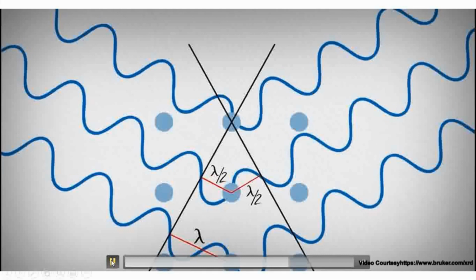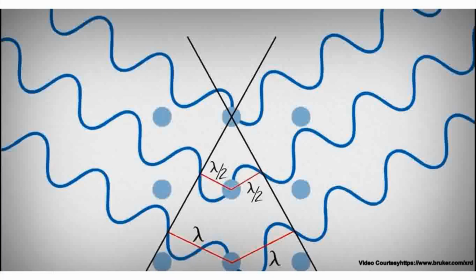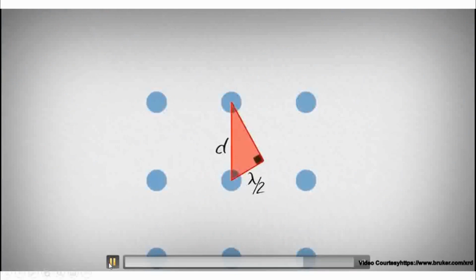So this is something which you understand here, and this keeps happening for all the planes as we go. So if you see here for this plane, you see the lambda. So this is one complete lambda which it has traveled, this is one full lambda, this is another full lambda. So this again is a constructive interference, because if you remove these two complete lambdas, the phase here and the phase starting here is almost matching the phase here and the phase starting here, right? So if this is not complete, then the constructive interference will not happen. So for each of these planes, what is different is this lambda which it is extra traveling, if it is complete to one full lambda, then a constructive interference is likely to happen. So okay, this I think is a very important concept, and that is how you understand and how you calculate.